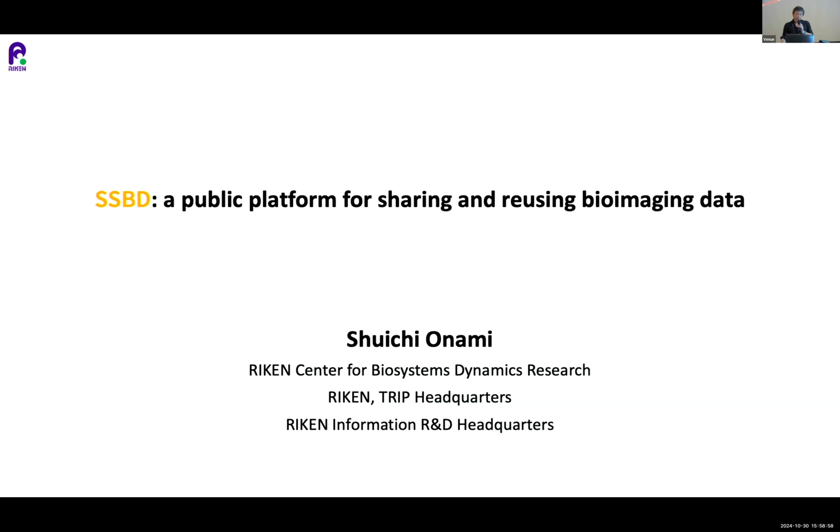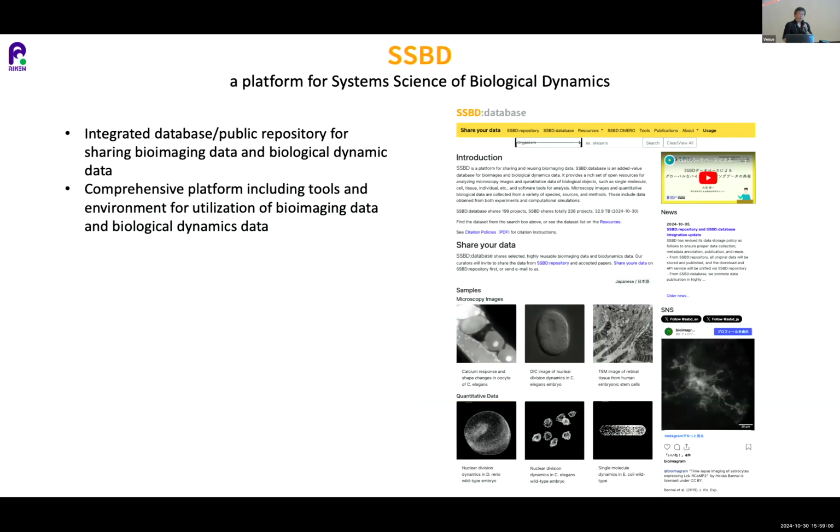So I'll talk about the SSBD and more. The SSBD is a platform, a database and public repository for sharing bioimaging data and biological dynamic data. It is also a comprehensive platform, including the tools and the environment for utilization of the bioimaging data. So this is the SSBD.